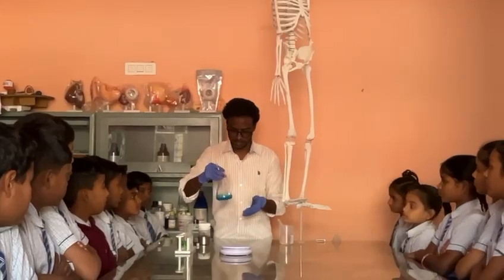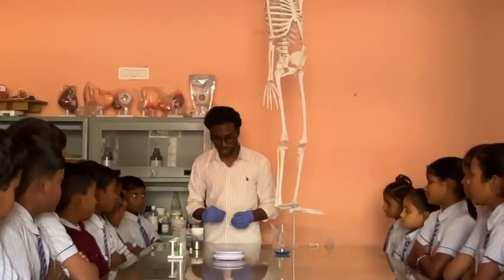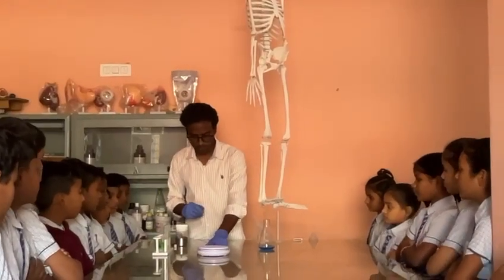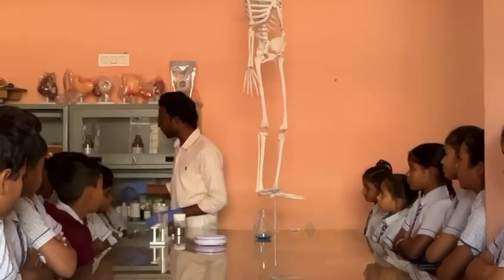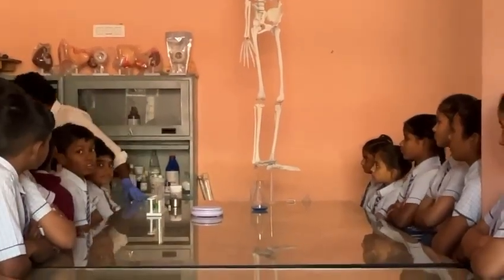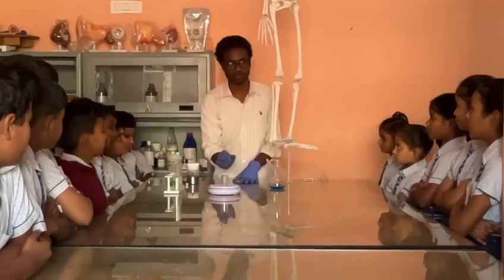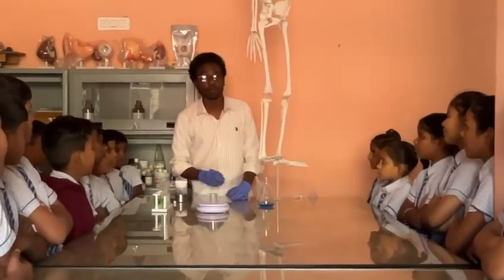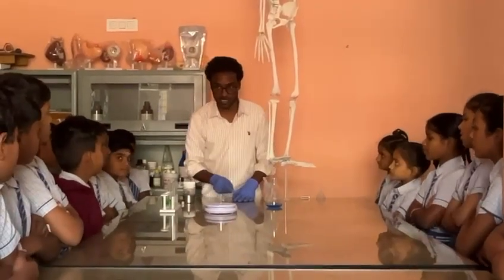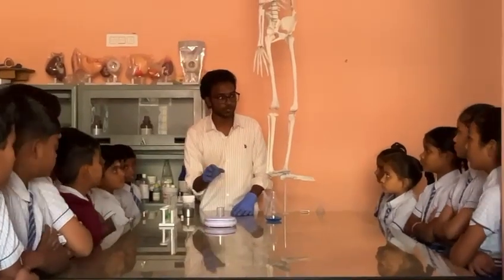Then we'll keep it aside until it gets dissolved. Until then, we'll take some salt, like 10 to 20 grams. Every time we keep any apparatus, beaker, or anything on the weighing machine, we should use butter paper. Or else we can also use equipment or any apparatus to measure anything.